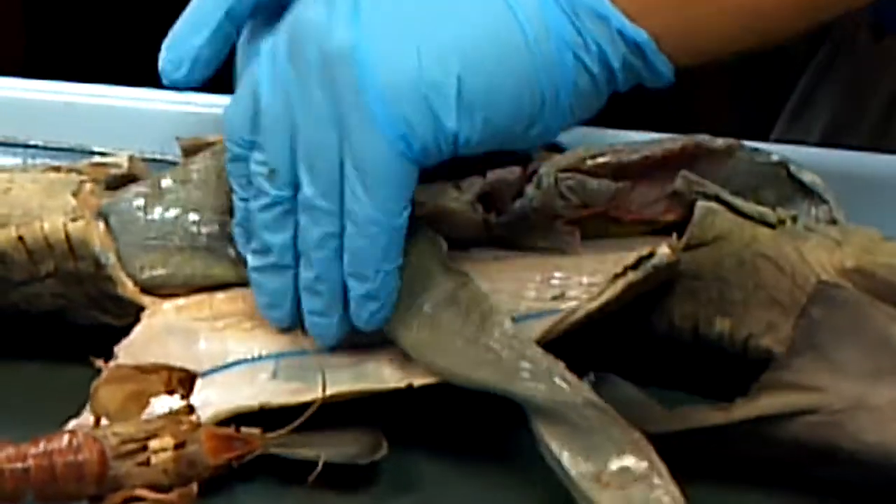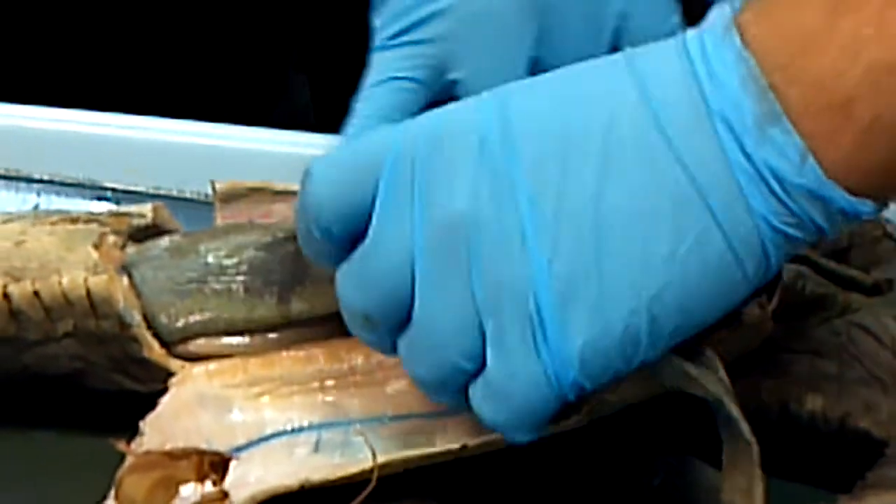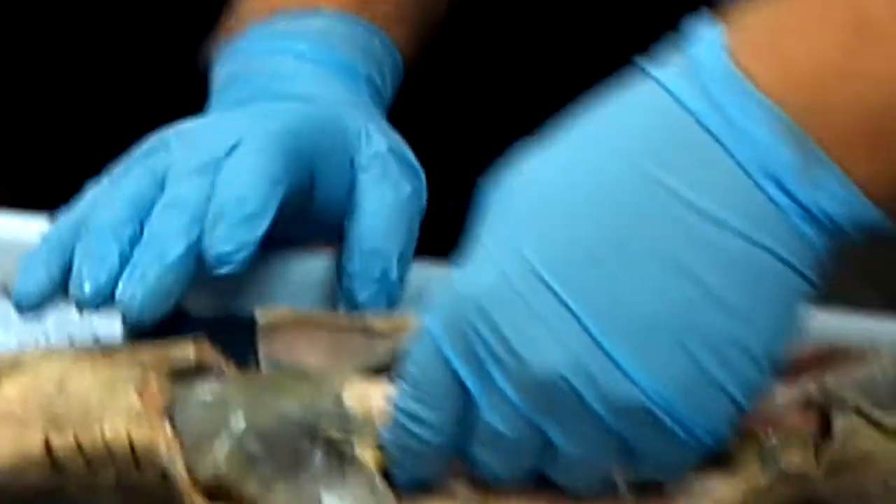If we can tilt it over — remember, the gallbladder at the end of the medial lobe right here. You can tell it's kind of green. They've injected it with yellow latex.